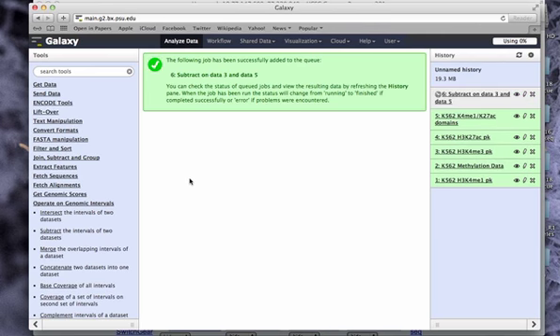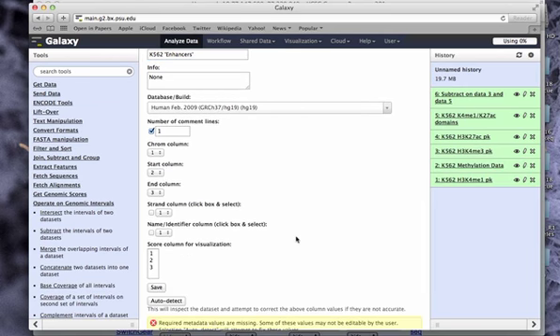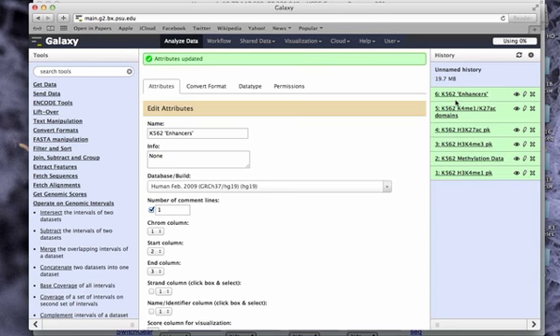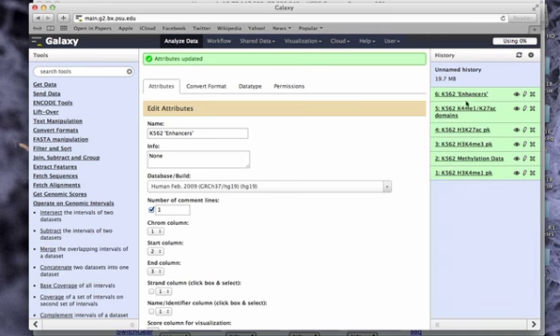So once we've done that, we have that nice overlap subtracted with trimethylation. This is going to be a rough marker of K562 enhancers. This isn't perfect, but I think it's a good starting point to look at enhancers in this cell line. So now we have about 16,000 potential K562 enhancers, and we want to integrate the methylation data now to say which of these enhancers are methylated and which are not methylated, at least based on this type of measurement.